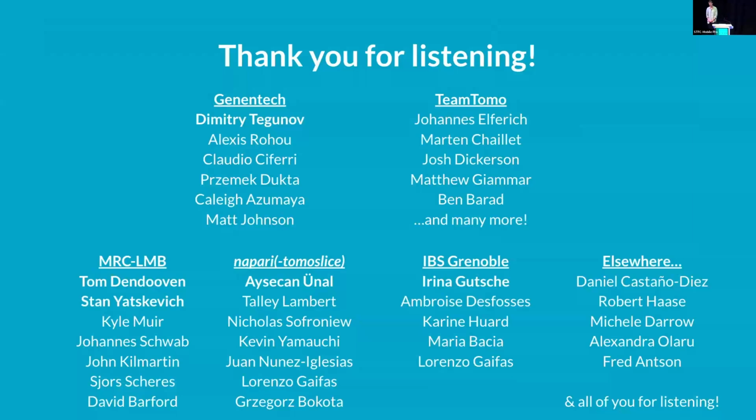Hi, Alister. Thanks. Looks great, and I think Warp for Linux is a good idea. And the GUIs, they look great. I was wondering, given that CCP-EM puts a lot of work into web-based GUIs and interactions with Relion and so on, that could also be a platform to which Warp and M could contribute. So what's the overall vision there? Will this remain completely separate with their own GUIs and so on, or are there plans by Dimitri and yourself to integrate more with the CCP?